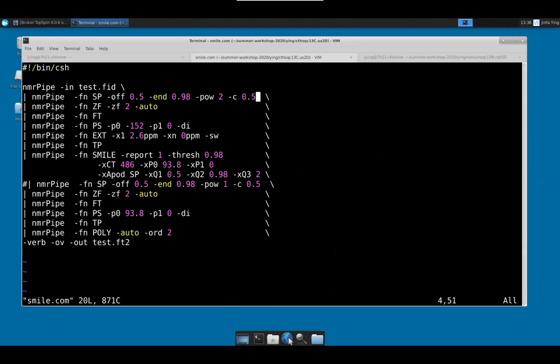Not big data, but a big data set, okay? But you could always truncate it or use different apodization like exponential broadening if it's too long. But if it is too short, you cannot get data back after the experiment is done, okay? So always acquire something longer than you need, and then you work with it later. So I assume you don't need to extend the direct dimension.